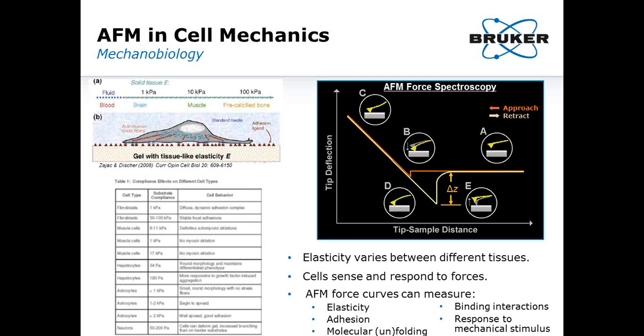So you can imagine that in the development of tissue engineering scaffolds or understanding diseases known to cause significant changes in the mechanical properties of cells, the ability to measure elasticity is very important. There are several ways to measure elastic modulus, including tensile testing or rheological measurements. However, with its ability to measure localized forces over a very small scale, AFM is ideally suited for measuring the elastic modulus of cells and tissues, as well as synthetic cell substrates.